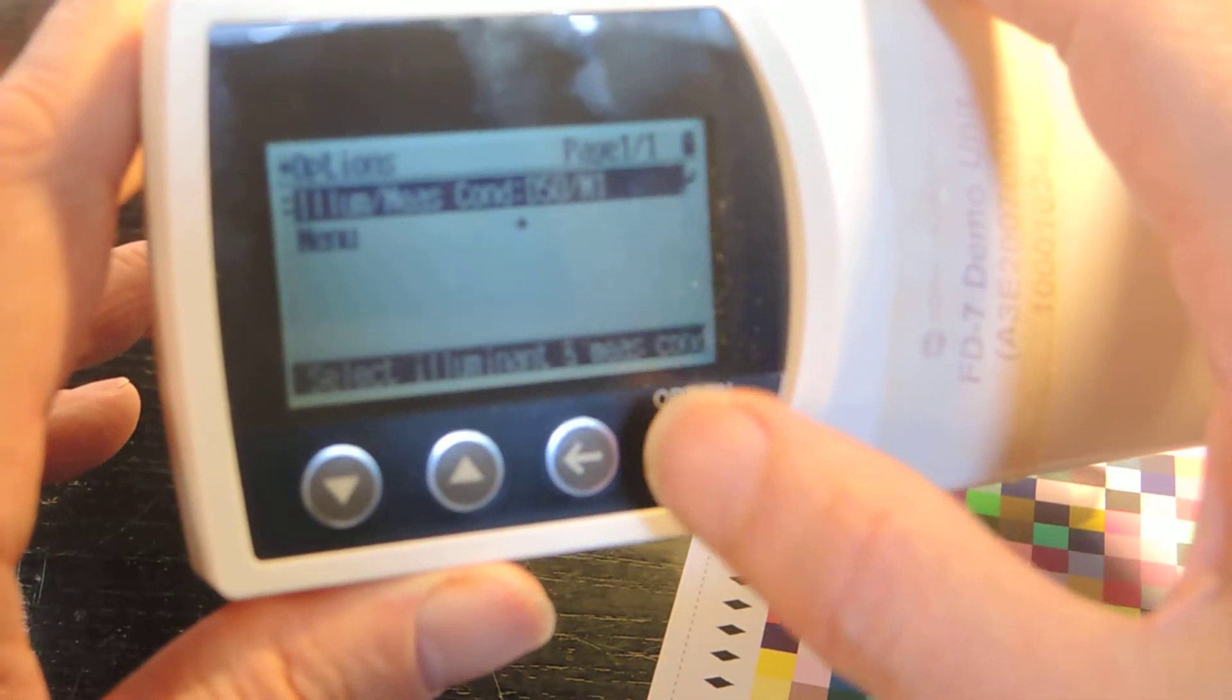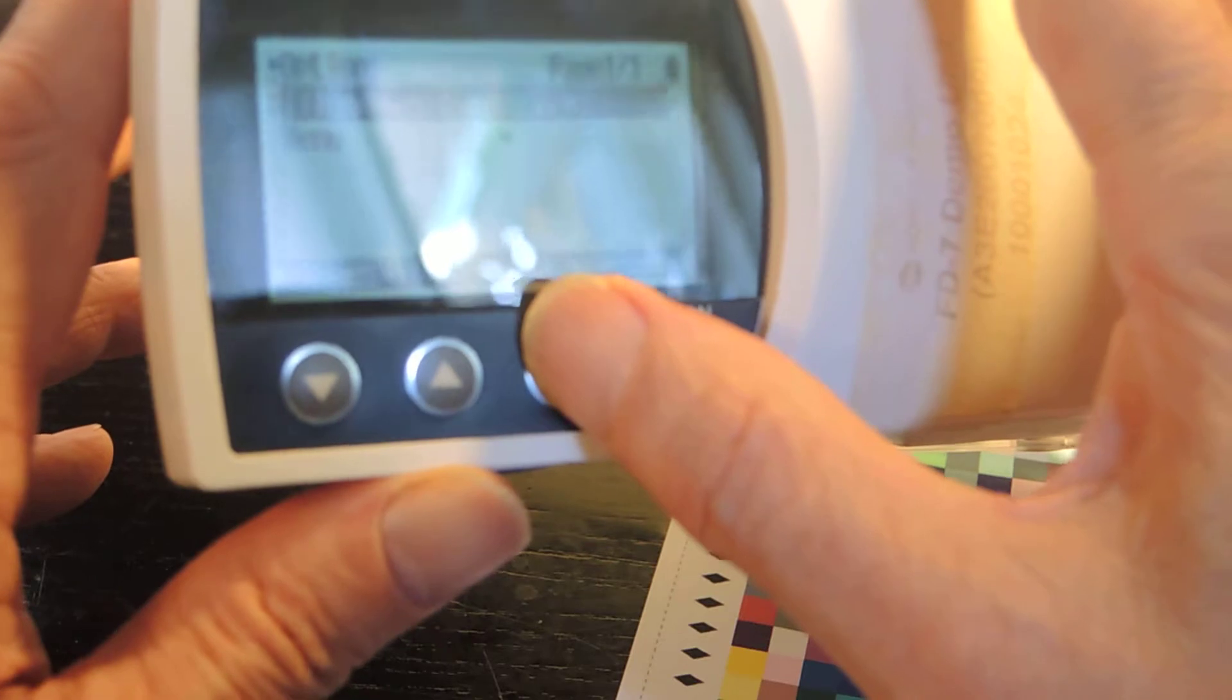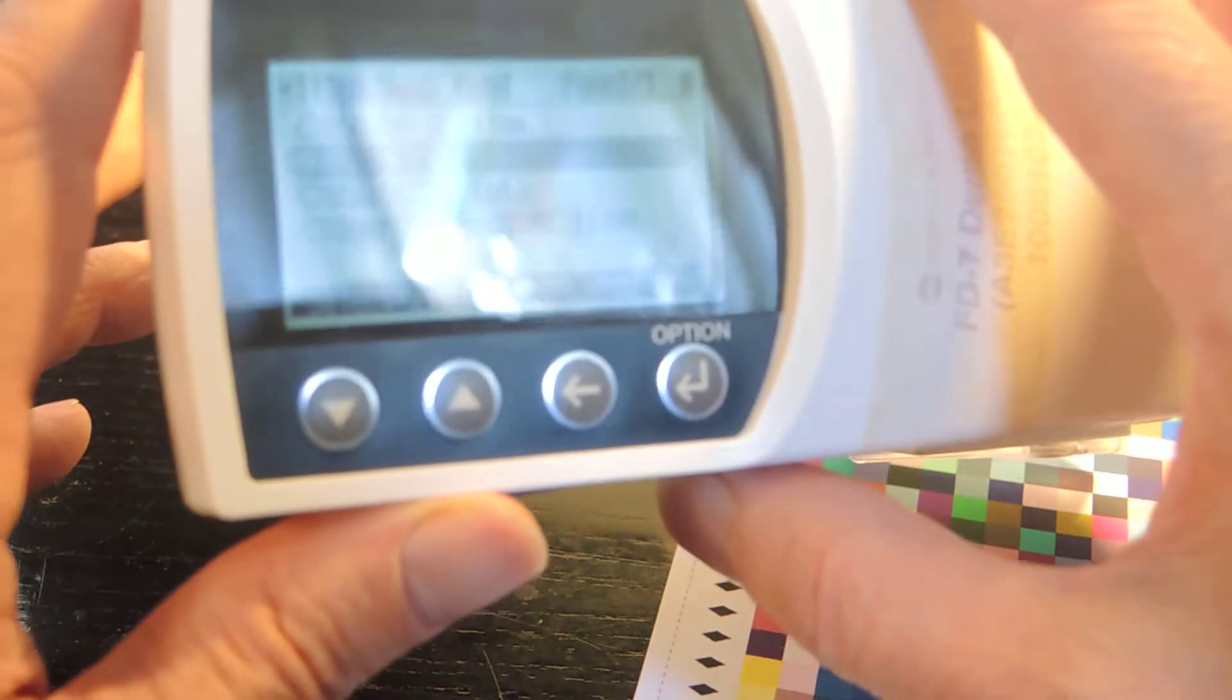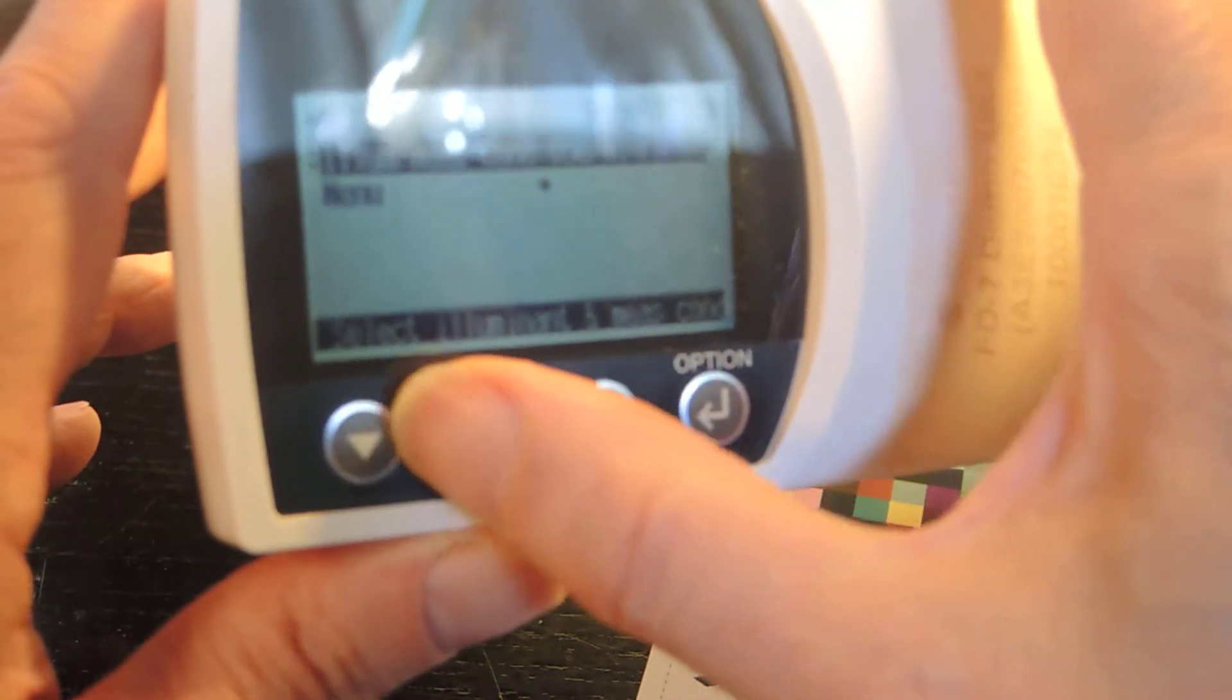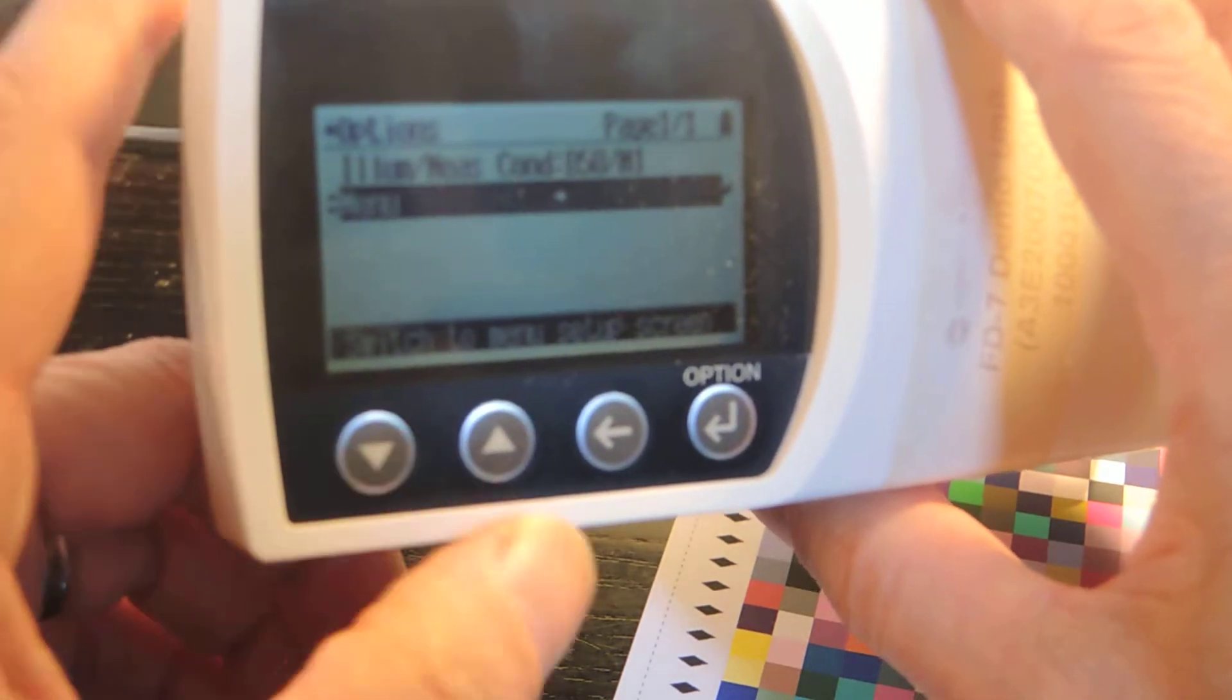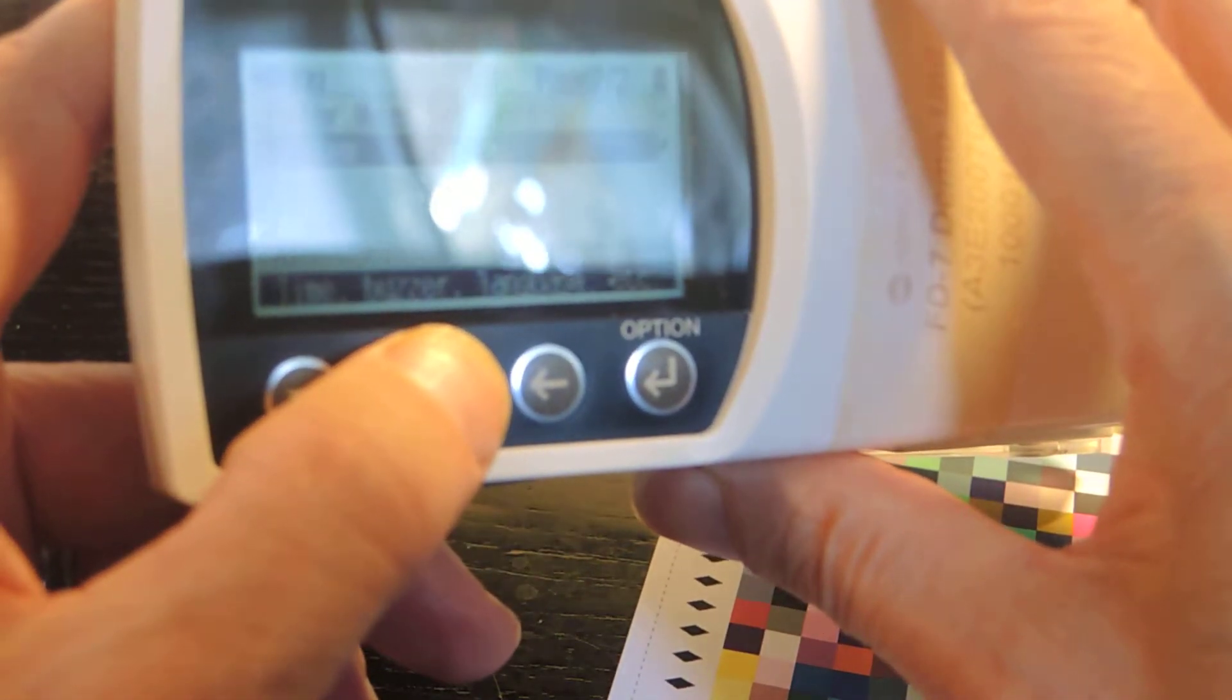I'm not sure how easy I can do that. Let's press enter. And the first option that comes up is Illuminant Measurement. That's not it. That's D50M1. That's the condition. If I keep pressing down and it says the user custom Illuminant. So that's not the correct menu. Maybe if I go down to what they call the menu, this second button here, let's see option, calibration, color difference. That's it.